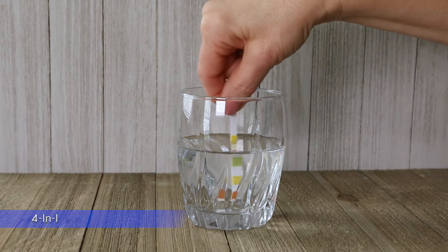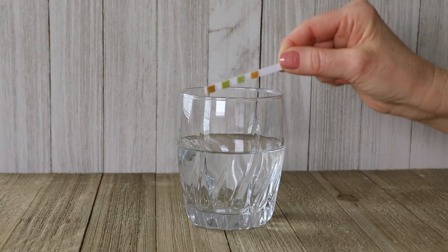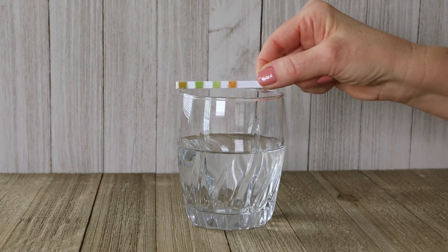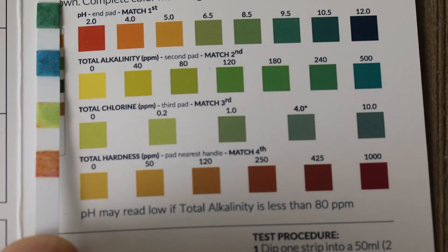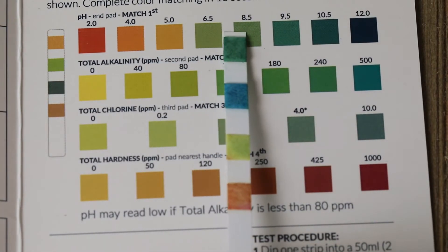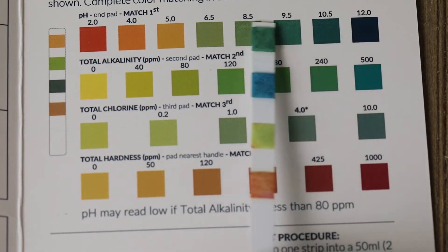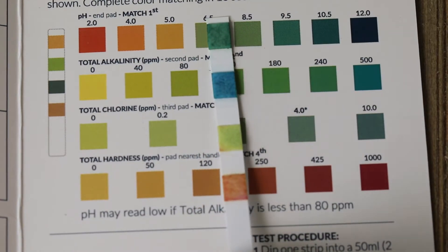Dip the four-in-one strip into eight ounces of water for five seconds. Remove and shake off excess water. Wait 20 seconds for the color to develop. The four-in-one test measures pH, alkalinity, chlorine, and hardness. Compare the strip to the color chart — the closest match indicates the level.